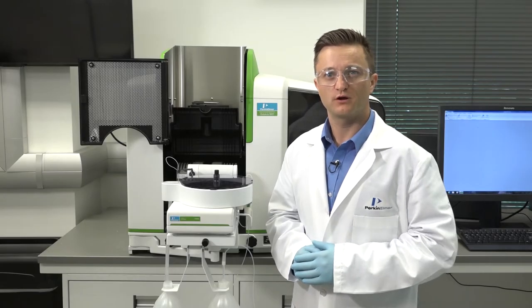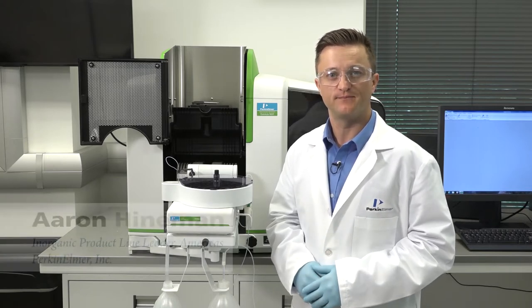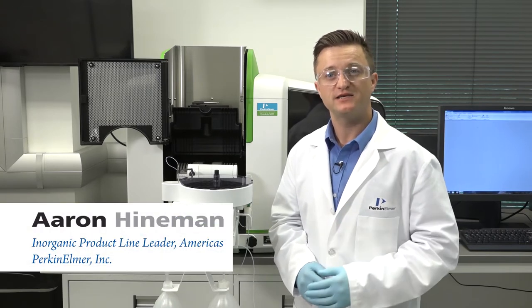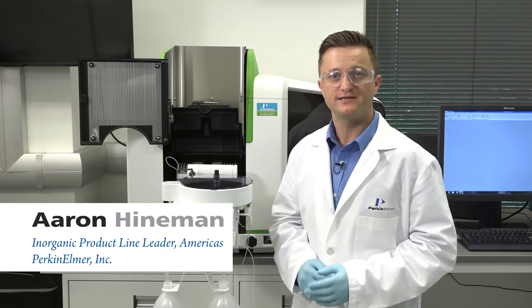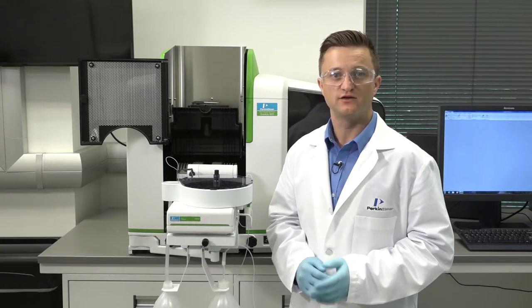Hi, welcome to a brief PerkinElmer video on maintaining your high performance Pinnacle AA system. I'm Aaron Heineman and in this video I will demonstrate how easy it is to change the graphite tube in your Pinnacle AA THGA instrument.